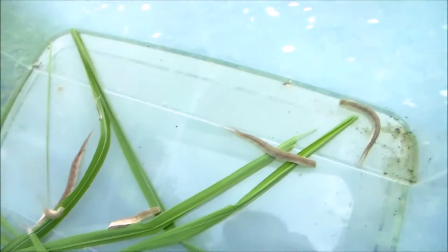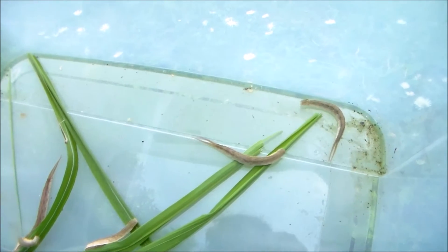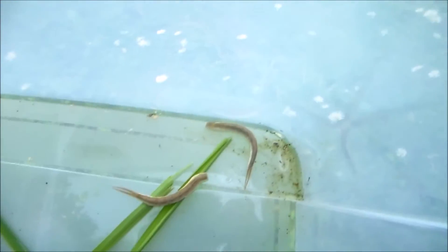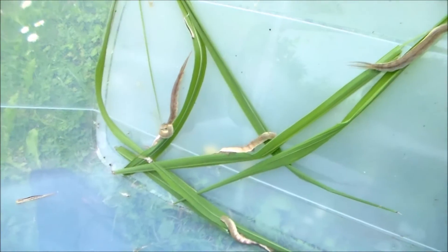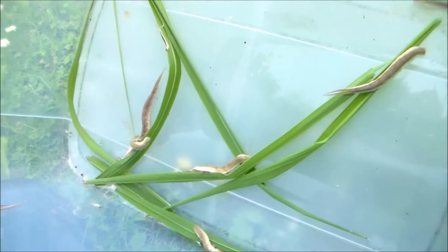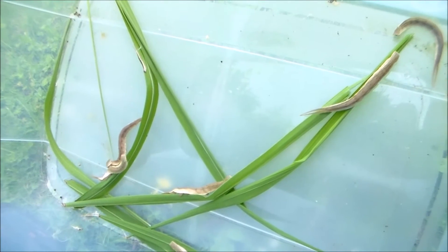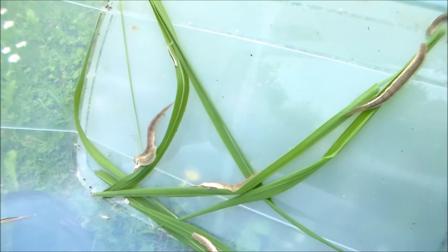Hi there, Mark and Paul. I'm making a little video for you guys to show you how to extract the gland and the defensive chemicals of the Erevanis larva. I apologize for my accent — I'm Dutch — so it may be possible that I pronounce a few words in a strange way. But I hope I speak English well enough for you guys to be able to understand me.